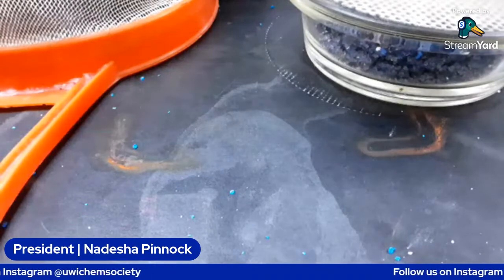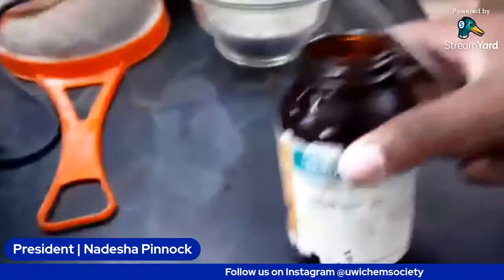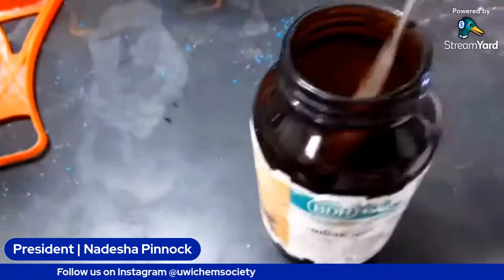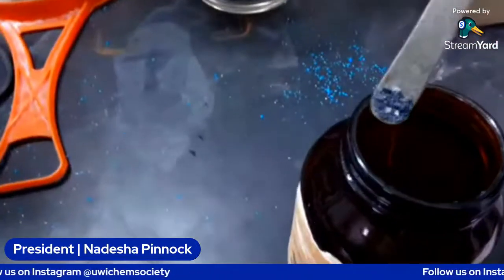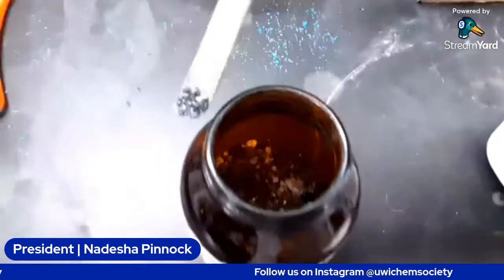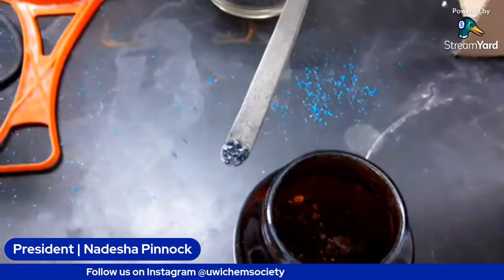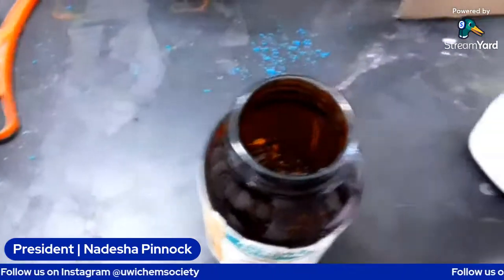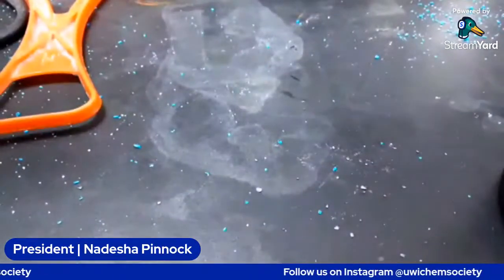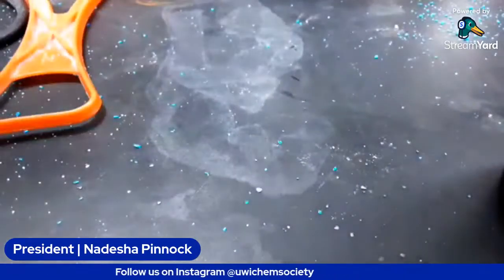I'm going to show you guys how I make the Lugol's reagent. So here we have with us some iodine. Show you guys what it looks like. That's the iodine. Oopsie. And our potassium iodide is white in color. Let me just show you guys what it looks like.